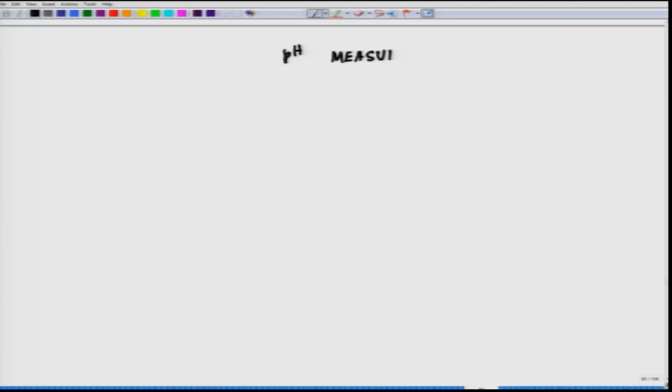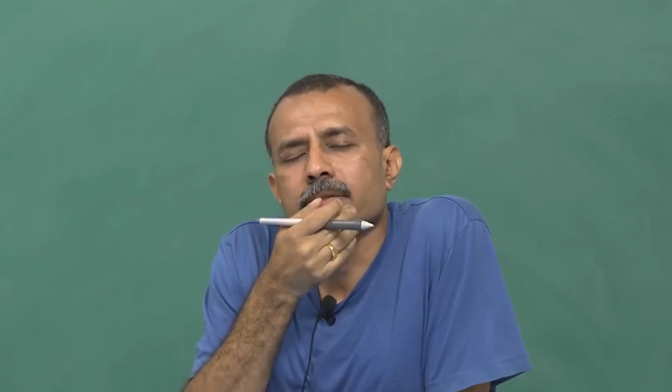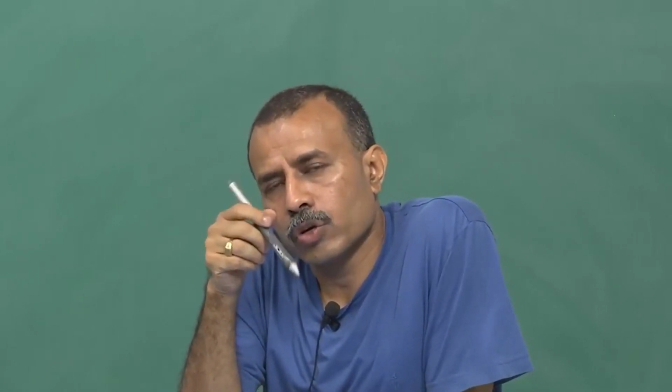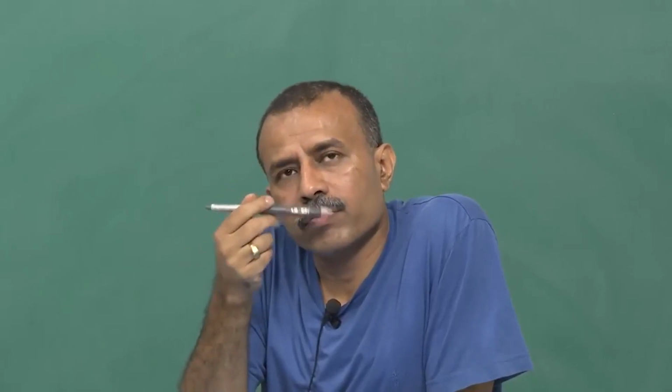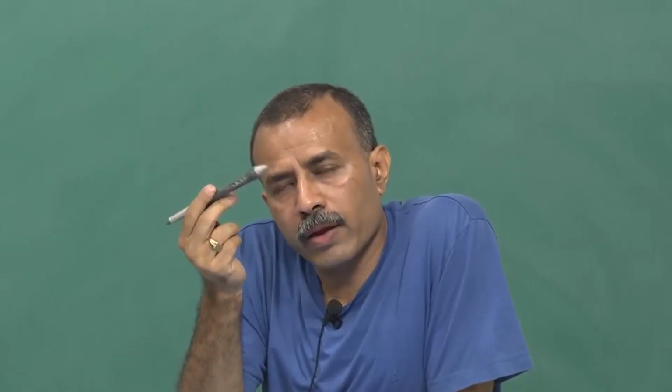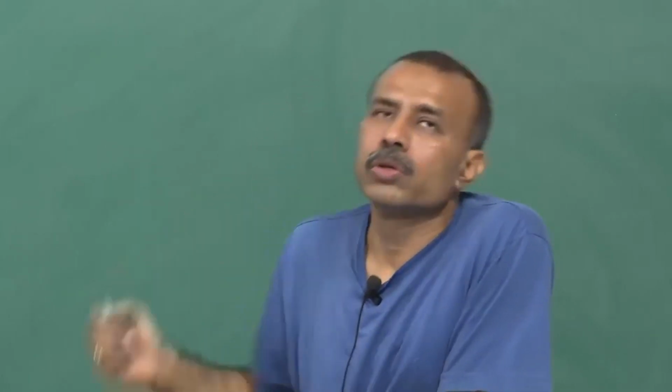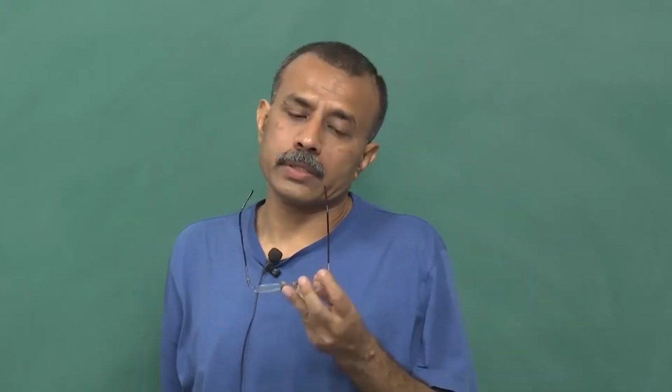All of you use pH measurements in your lab, right? So, we know that pH is essentially hydrogen ion concentration, H+. We have a neutral pH at 7. As H+ ion concentration, proton concentration, increases, it is called acidic, so we go to 6, 5, 4, 3, 2, 1, 0, and if it is alkaline, it goes to 8, 9, 10, 11, 12, 13, 14. So, OH- ion concentration increases. But where was the genesis, where did it all start?